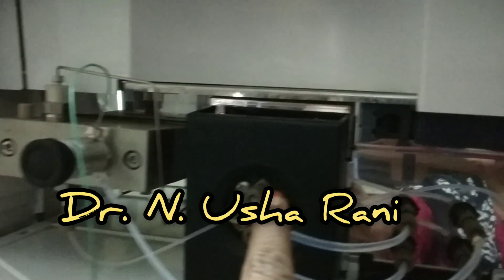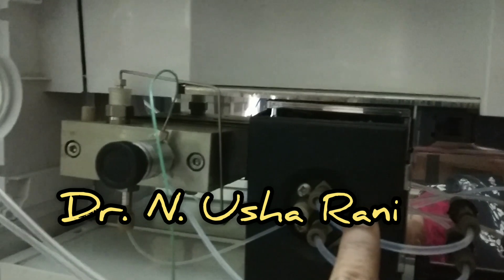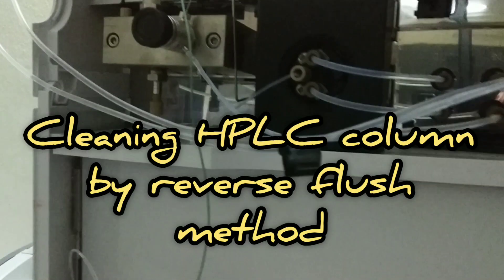Hello everyone, this is Dr. Nusharani. Today I'm back with a small technical video on cleaning of HPLC column.